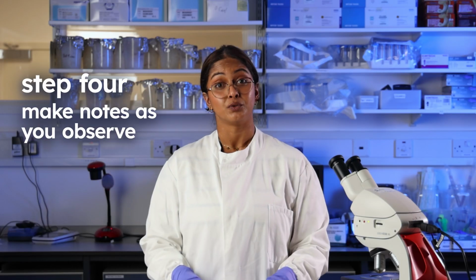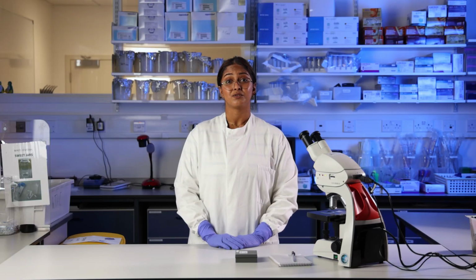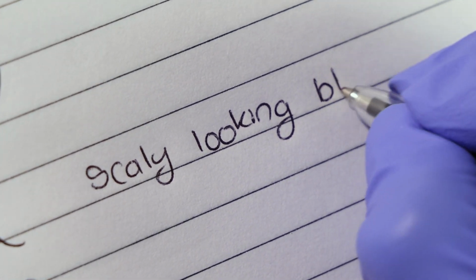Write down what you do recognize. Here are some skin cells and muscle. And describe in detail the things you don't recognize. I'm going to write a description of this: scaly looking blob. That way, you can look them up later without forgetting what you saw.